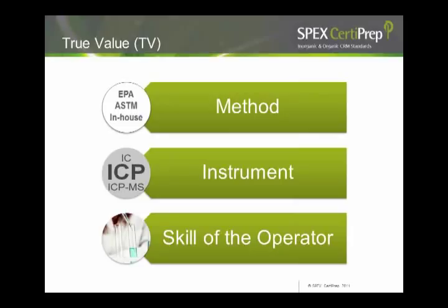Our main goal for today's presentation is to explain uncertainty in practical terms. We will be showing one of the ways to calculate uncertainty, taking into account the analysis of gold by ICP. We will calculate uncertainty associated with the measurements as applied to the process we have chosen.